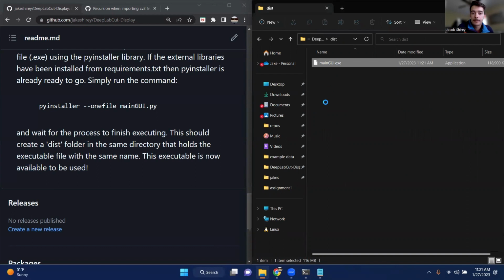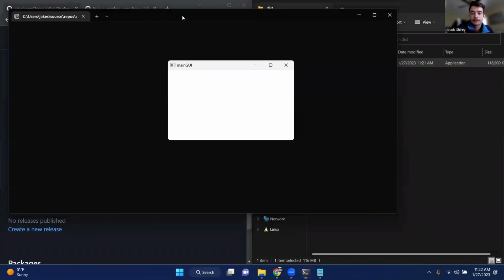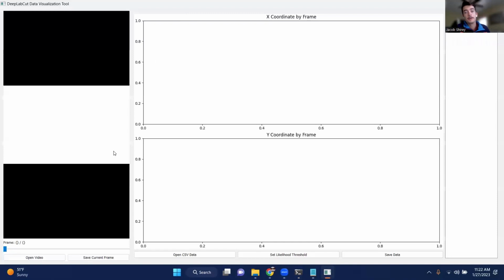So if we click run, DeepLabCut pops up. And we can add our videos and do all of our data analysis as we would have.